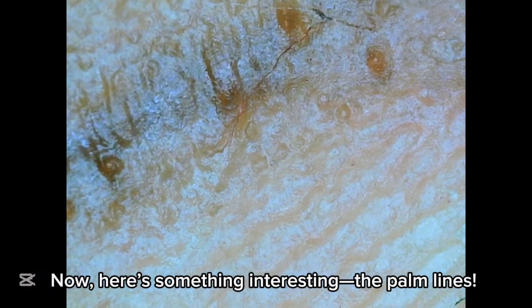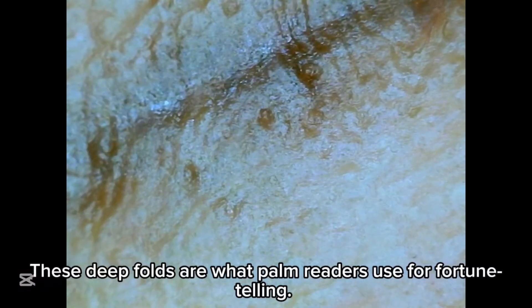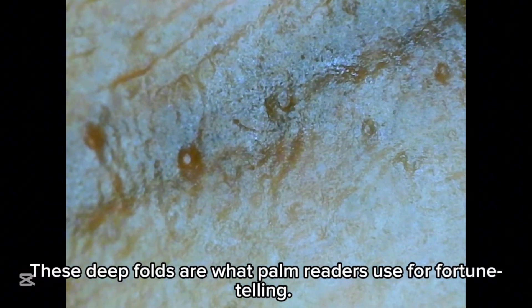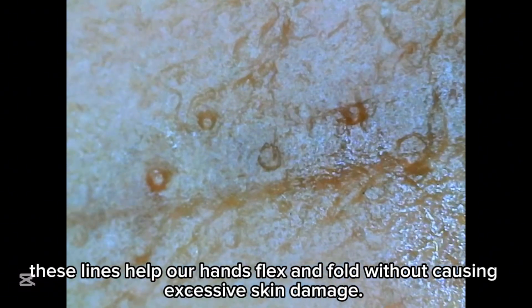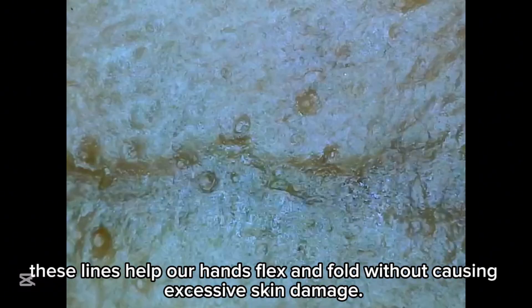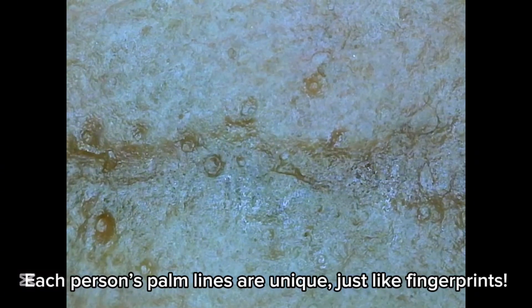Now, here's something interesting: the palm lines. These deep folds are what palm readers use for fortune-telling. Scientifically, these lines help our hands flex and fold without causing excessive skin damage. Each person's palm lines are unique, just like fingerprints.